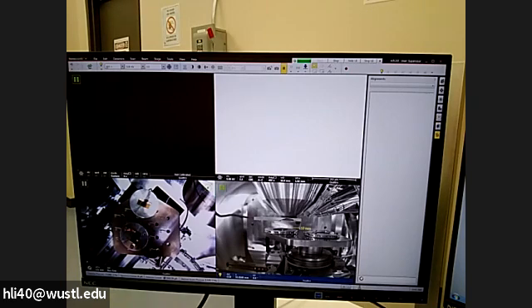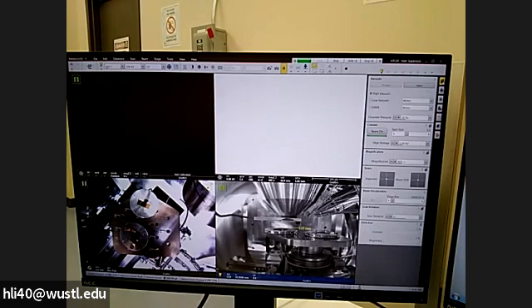All right, let's come back to the first button. We are ready. You see the chamber is fully green. We have selected the right kV and spot size for us. We're ready to turn on the beam. Click the beam on.